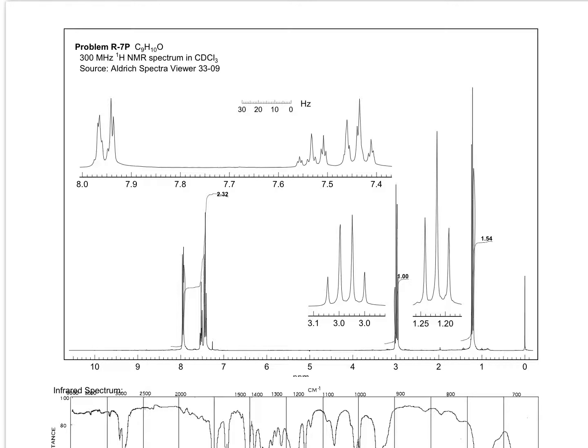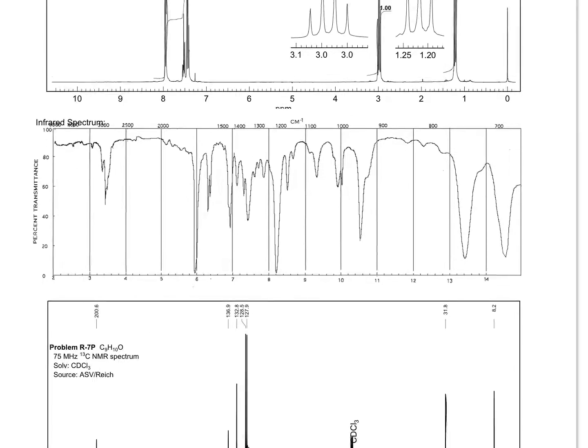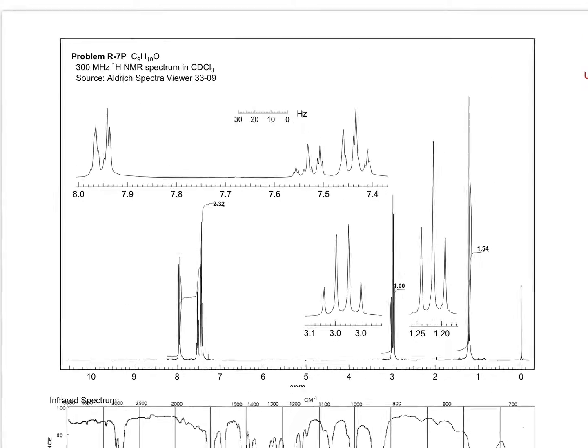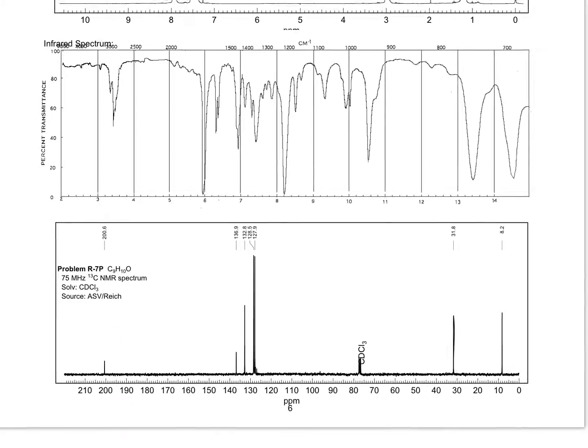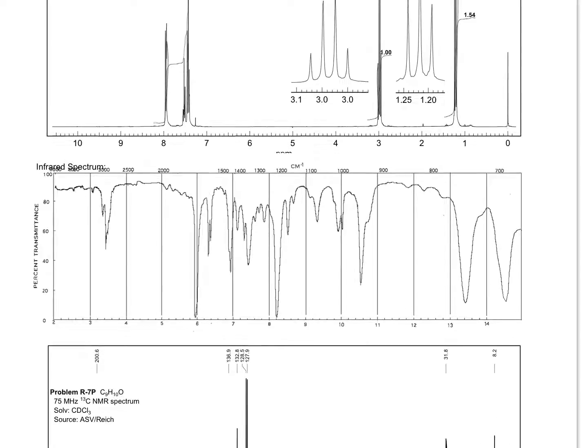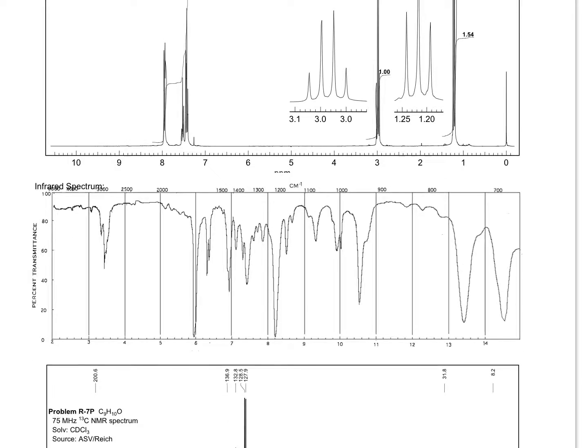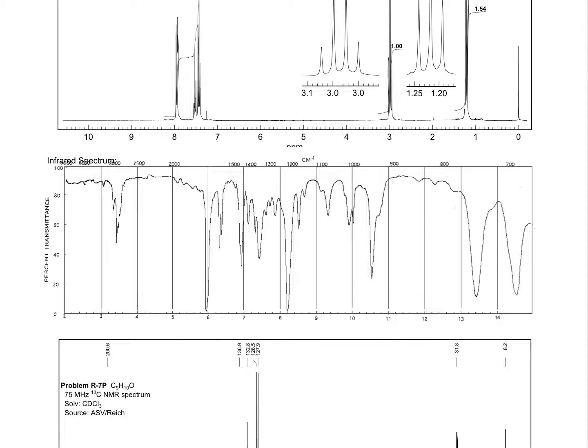Okay, so in proton NMR, carbon NMR, and IR, each of them has its strengths and weaknesses. Sometimes the weakness is it just gives you a lot of detail, but you're free to ignore it. So let's actually start with the IR spectrum, since this is probably the most accessible of all.